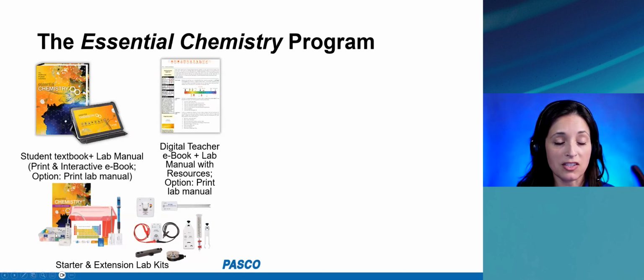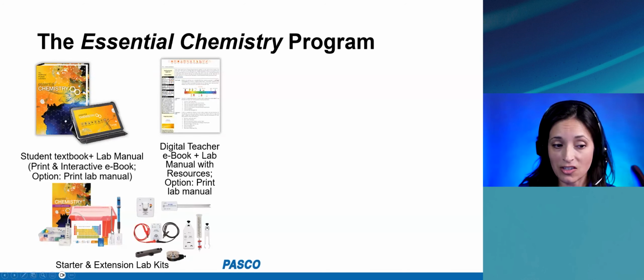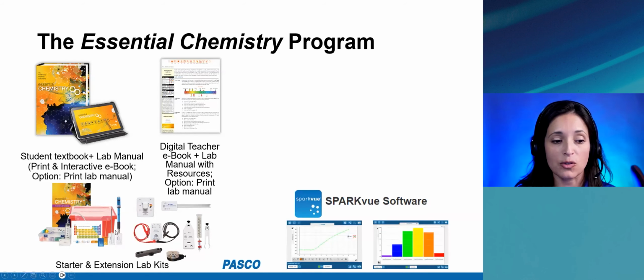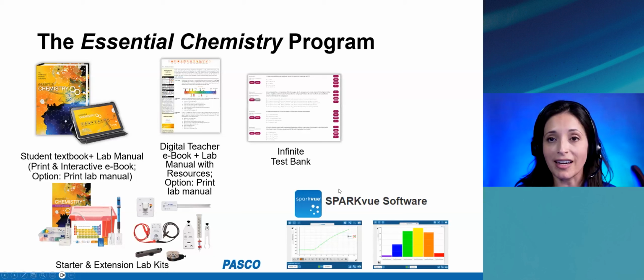So that molecule set that I just used and the temperature sensor that I just used are both in that starter set. Also included is the software that I showed you that you need to use with the sensors. On top of that, there is a test bank that comes with the curriculum, and it's called Infinite because the quantitative questions change values.